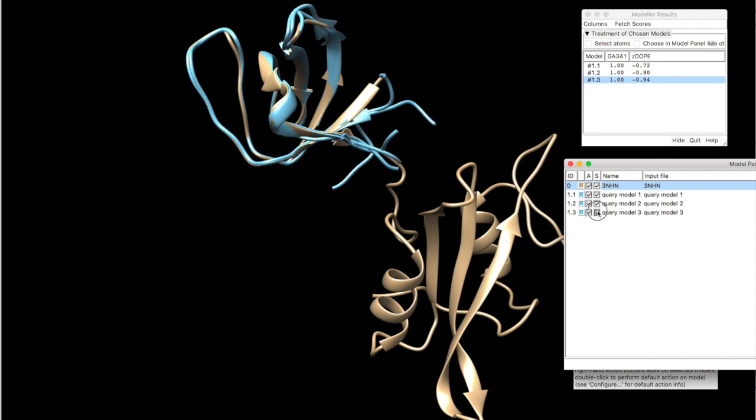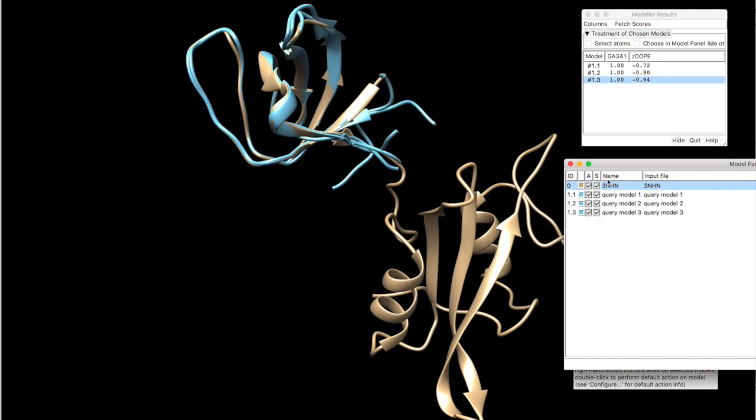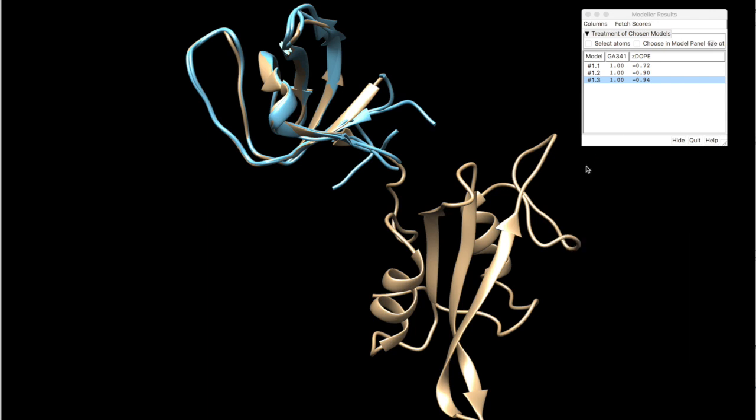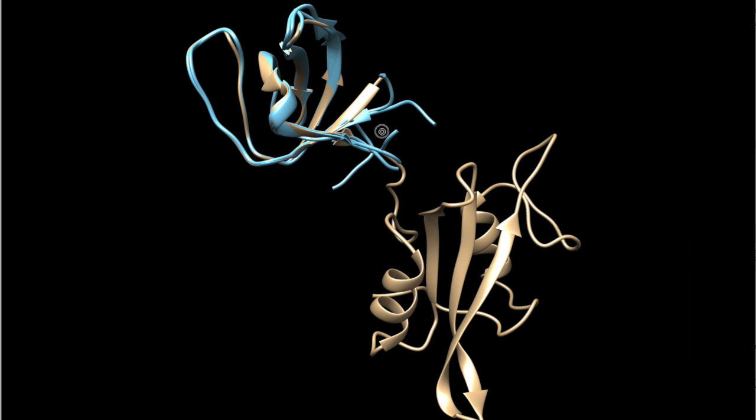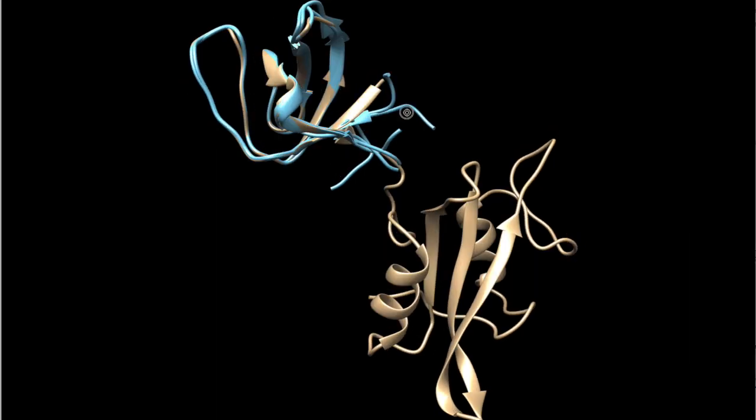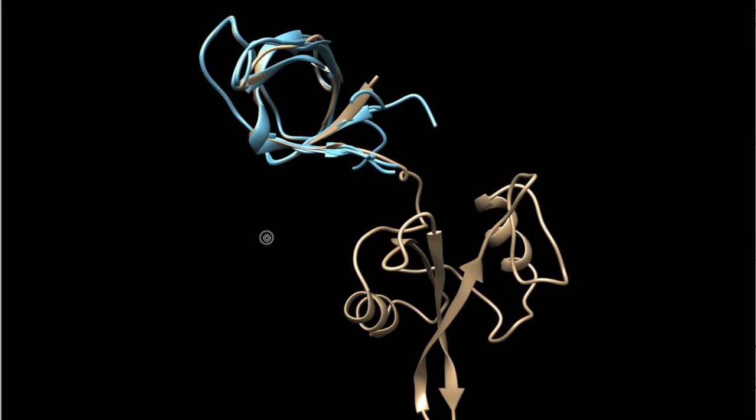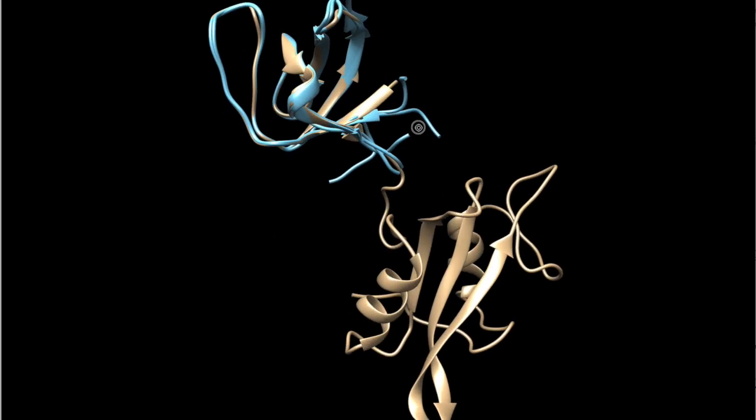Once you build your model, your job is done. And you can select another model and save the PDB. So this is how you model using Modeler and Chimera.